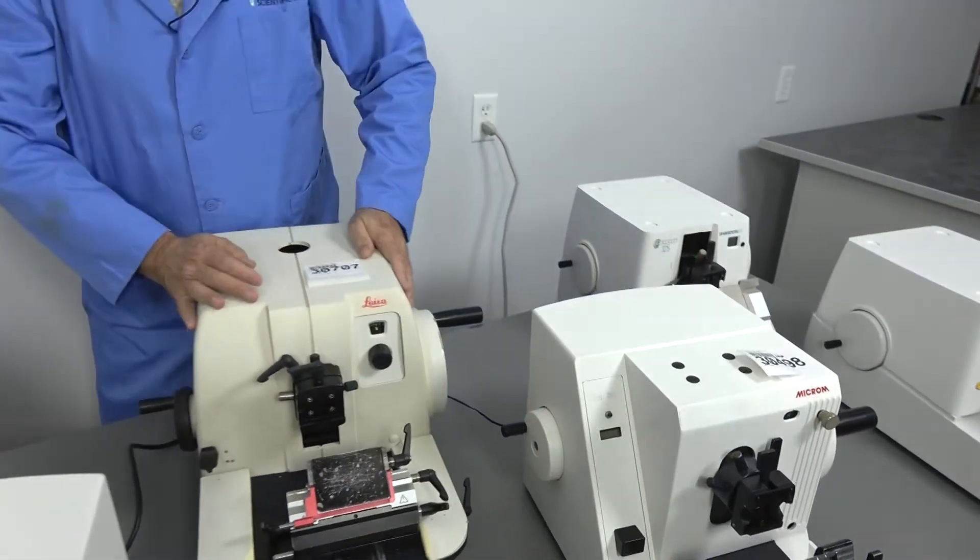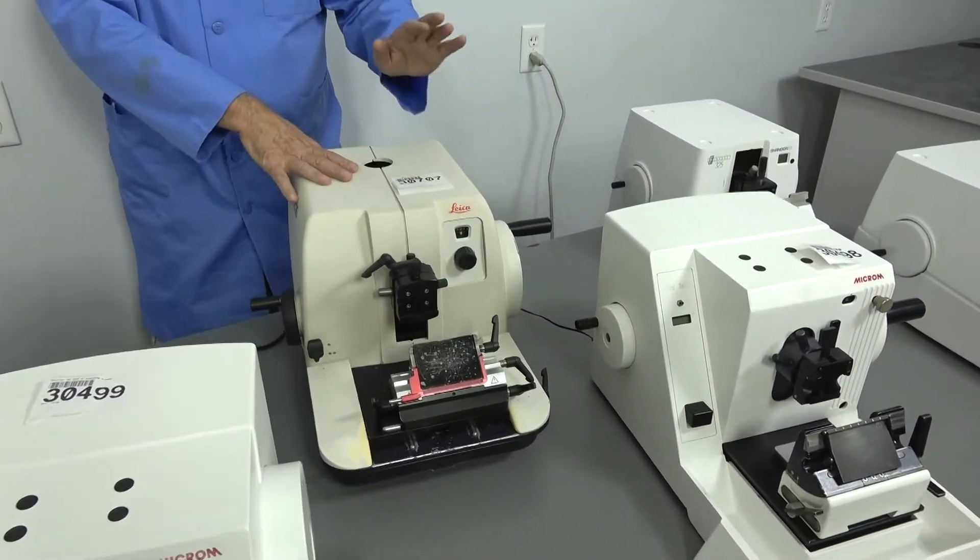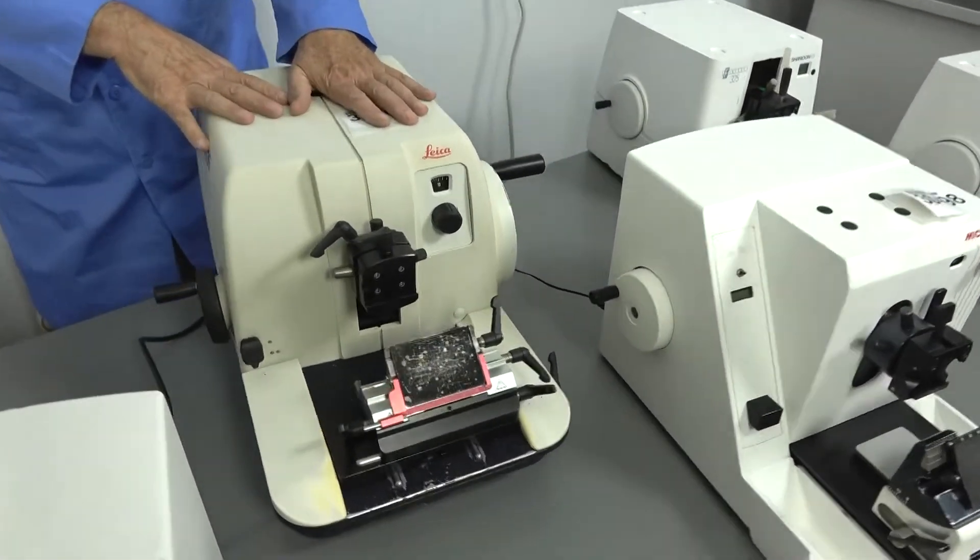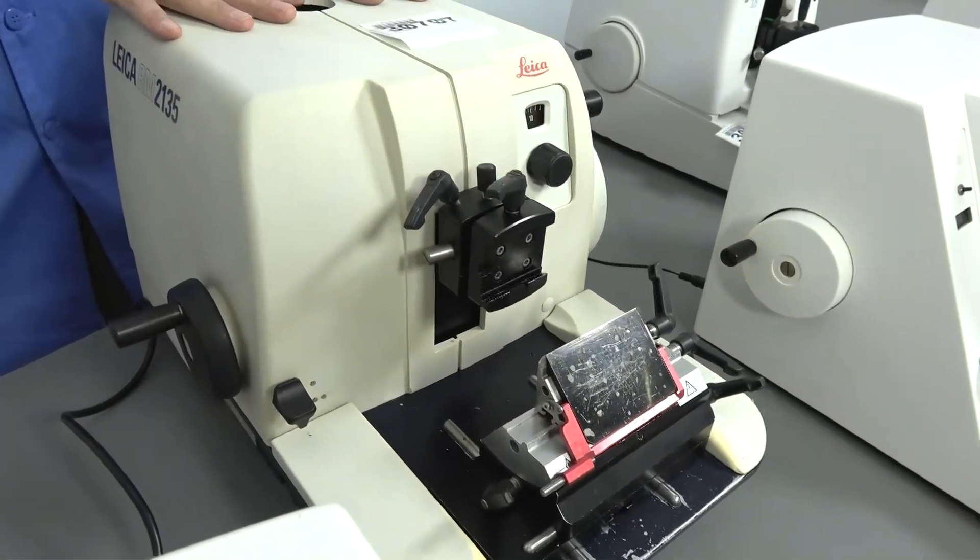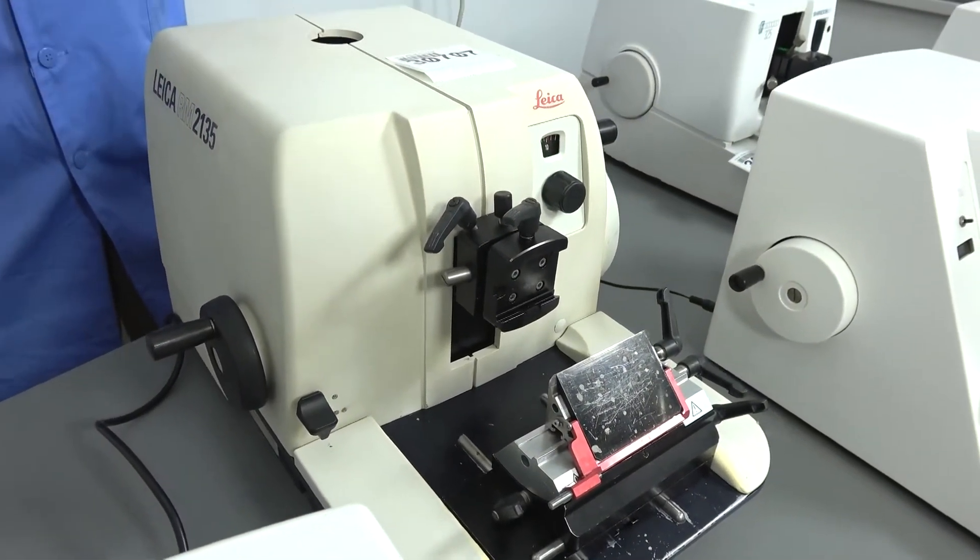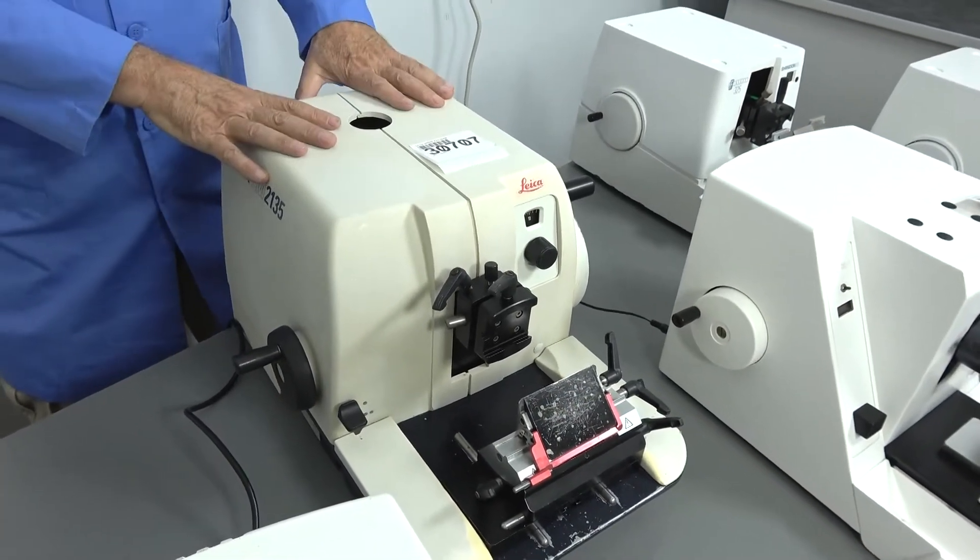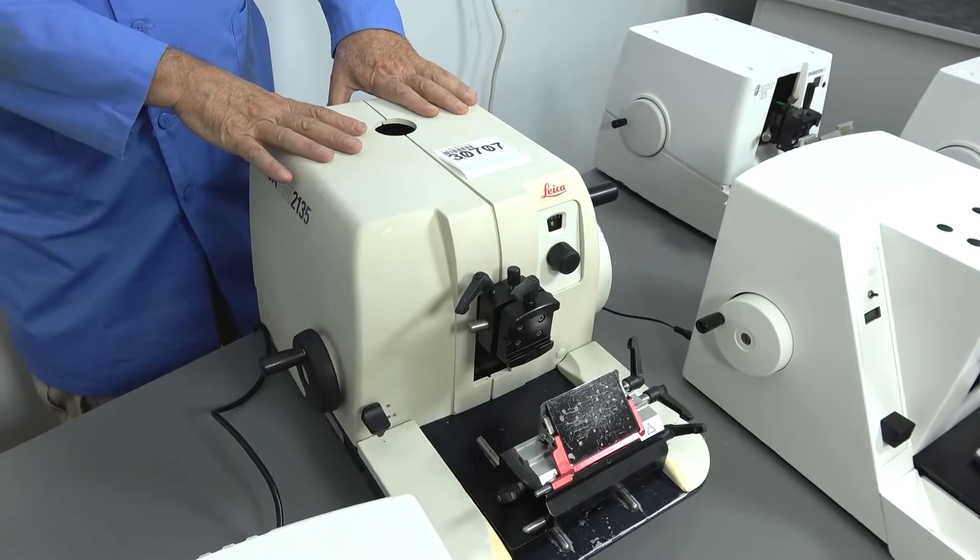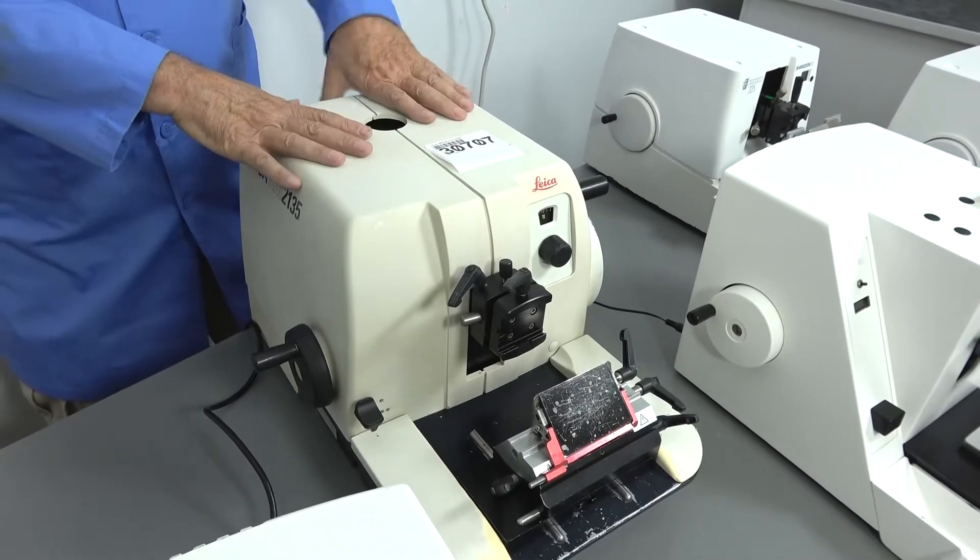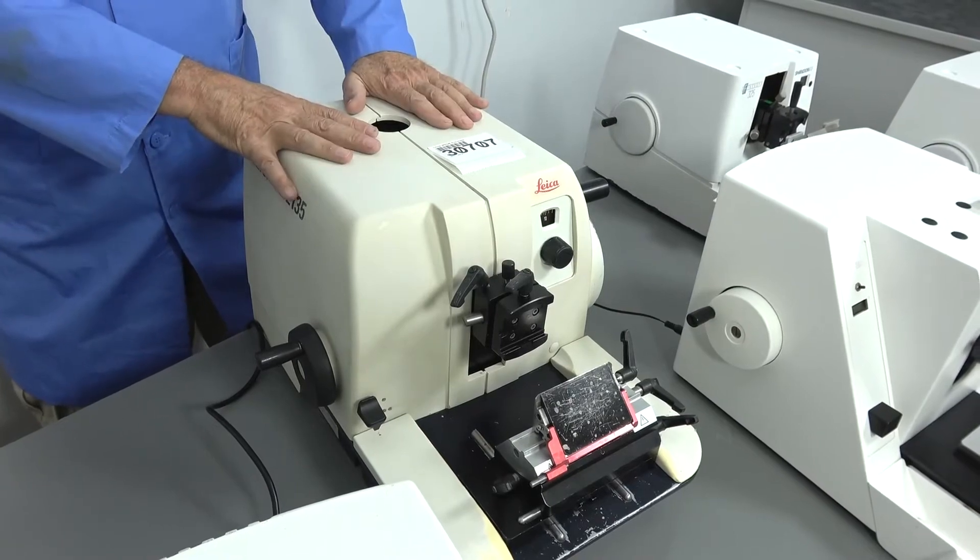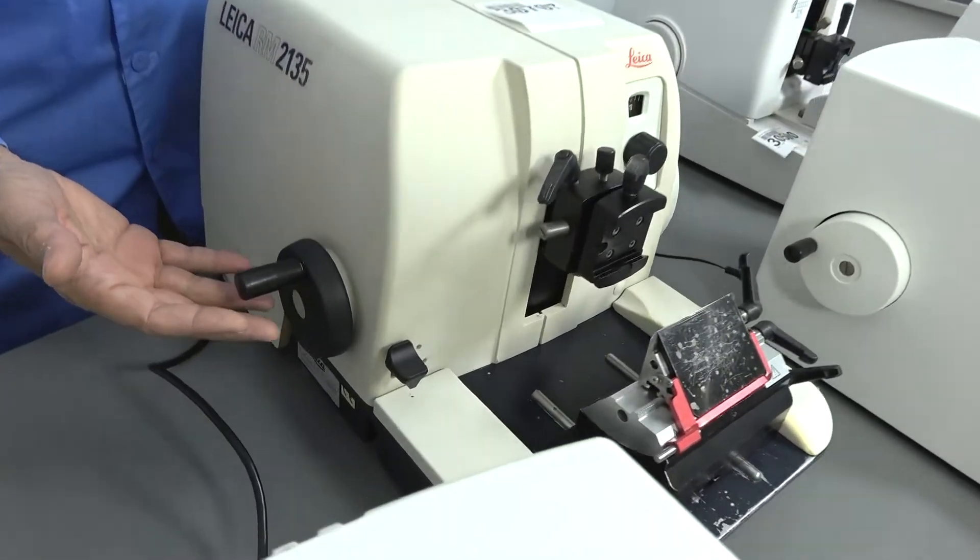The Leica, as I said, is one of the mainstays in the industry. Great machine internally. It is a work of art of the engineering that's in there. It is a little tricky to work on if you ever have to go in, but being this is the mainstay, you can always find somebody to work on a Leica.